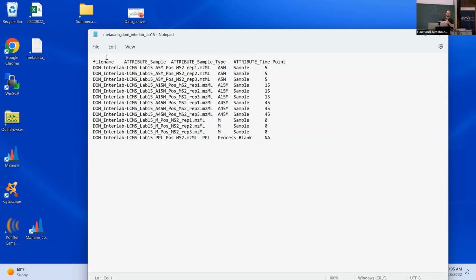Then I get chlorophyll levels, salinity, pH, whatever, you name it. You may get other very complex metadata, such as community composition. So if we do parallel sequencing, we get an entire ASV table per sample, which in that sense could be metadata.